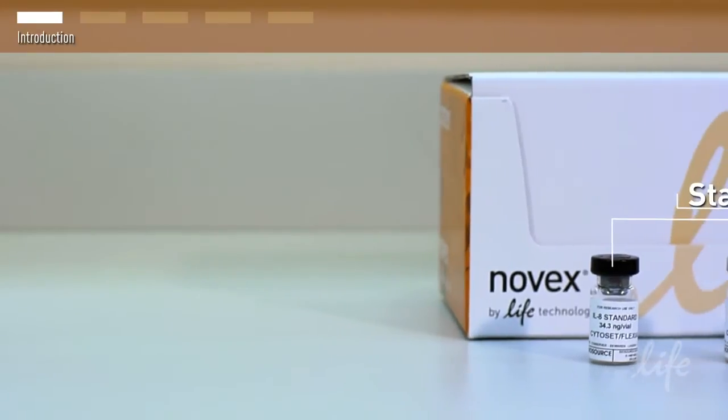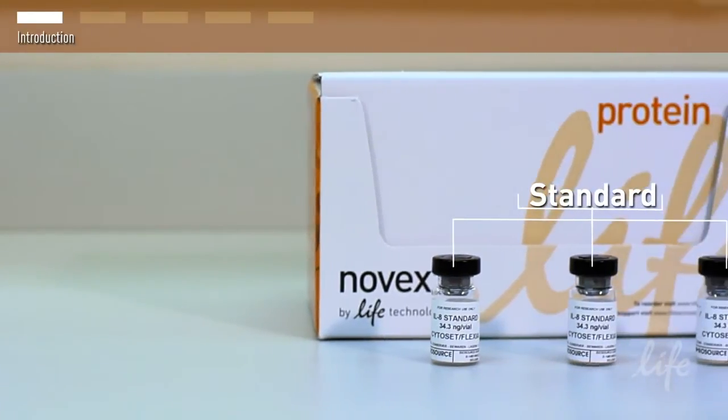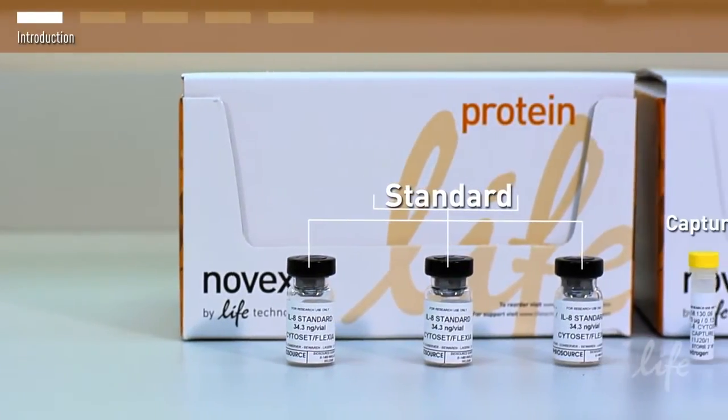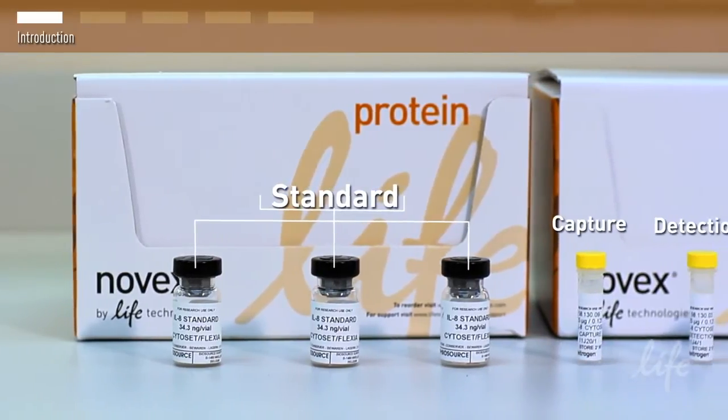This video will show you how to use Novex antibody pairs to create your own ELISA for measuring the quantity of protein in a sample.